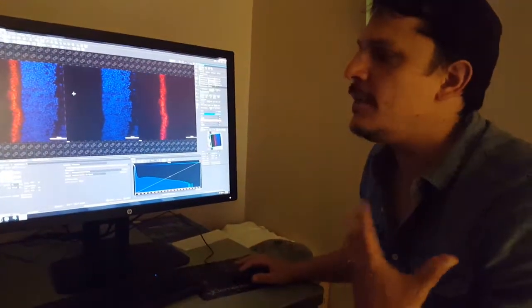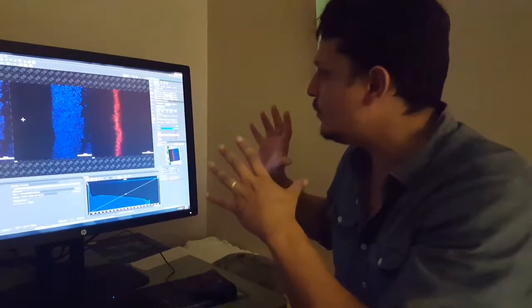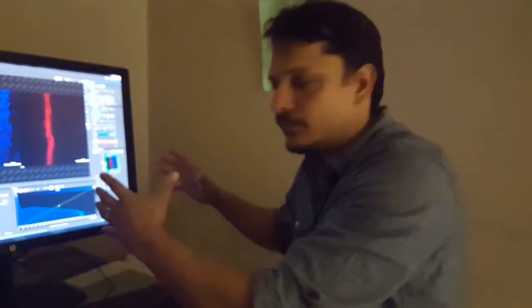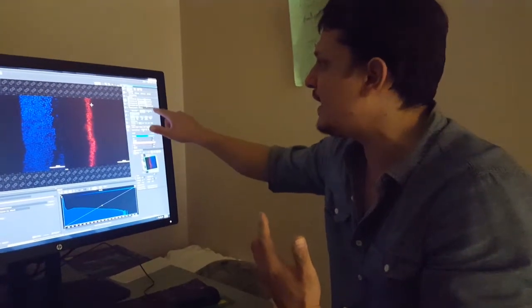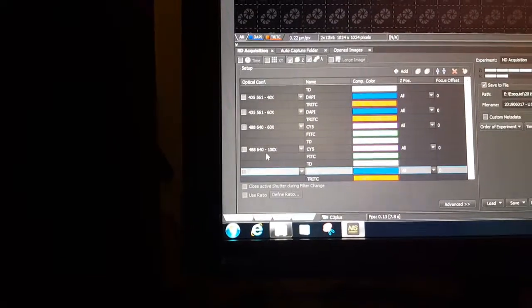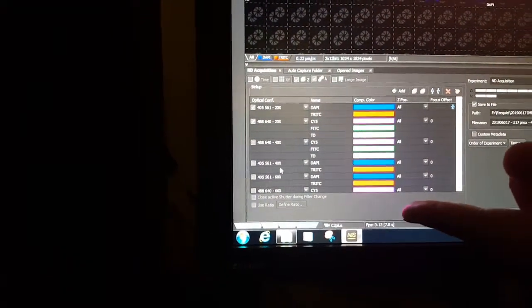So now what we need to tell the microscope is which of these configurations need to be switching on and off. Okay? It's going to first do the blue and red, and then it's going to do the green and the magenta. And we have to tell the microscope to use the 40x for the blue and the magenta, and not the 60 or the 100 or the 20. So for that, we have to go to this part that is lambda, and we have to click it, and here we have a list, or you have to make it, of the settings that you have. If you go to the top, I have 20x, 40x, 60, and 100x. In this case, we want to unclick the 20x, and we want to click the green and magenta and the blue and red for 40x.